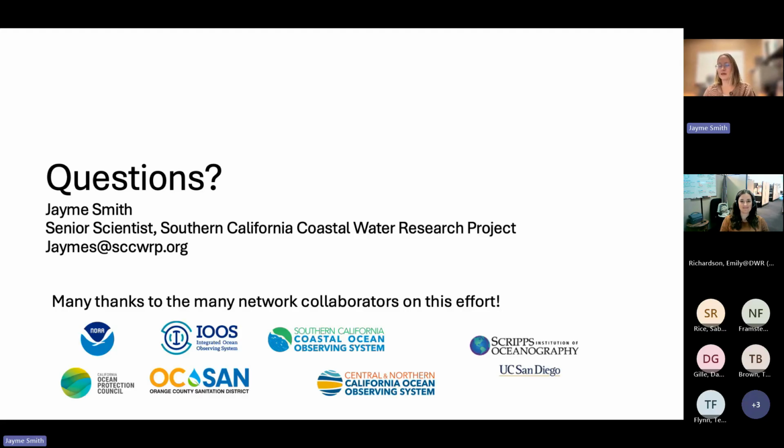We've had some of these on piers when you have a big storm and something hits it, and all of a sudden you're either not getting images, you can talk to it but it's not taking images because everything got knocked out of alignment, so you have to bring it back and refocus everything. So it depends on your exact boat situation and the type of activity, but if you're skipping along, that's probably not an ideal situation. You might want to take your samples back and run them in benchtop mode or something like that.